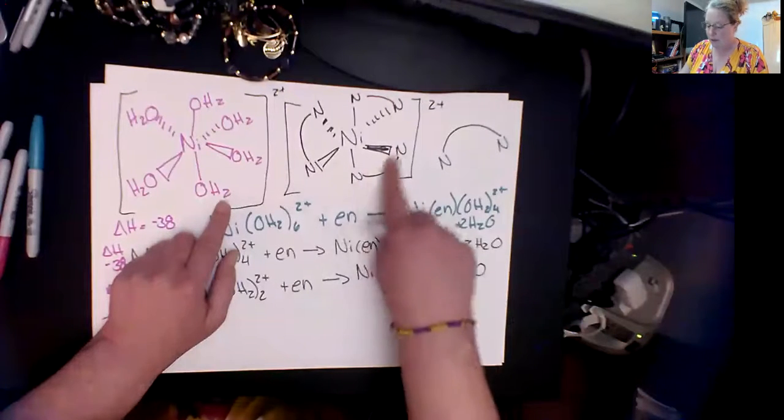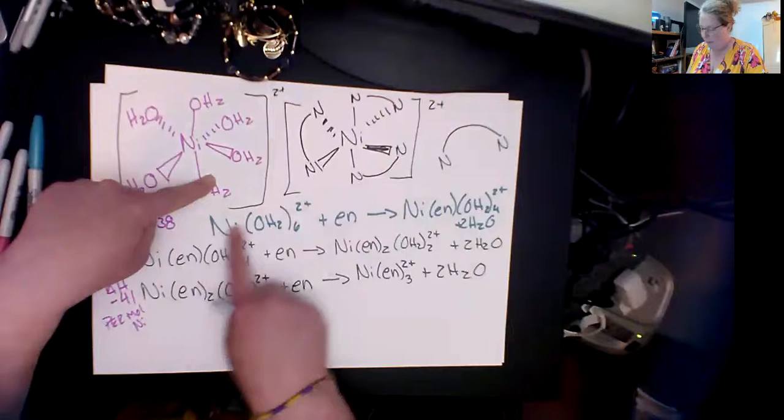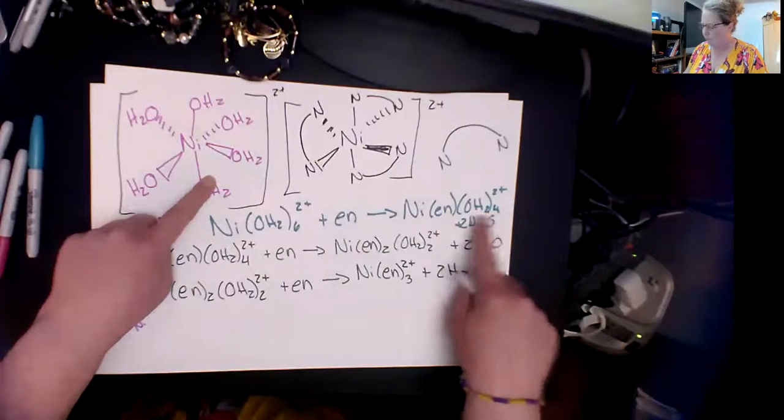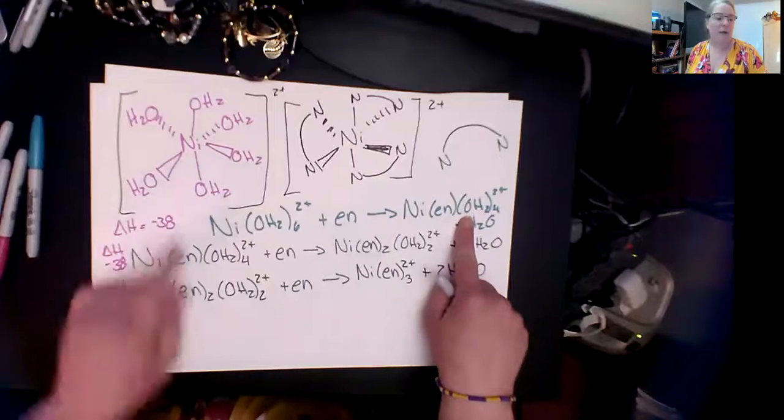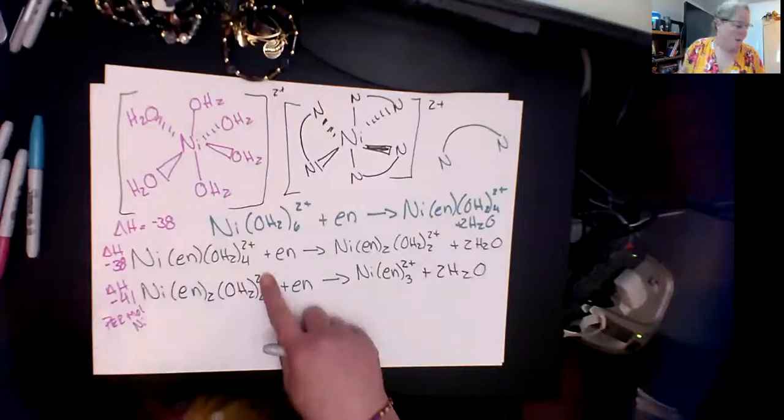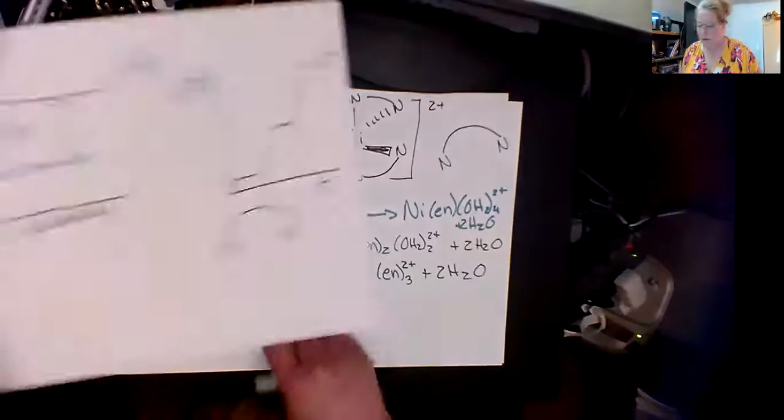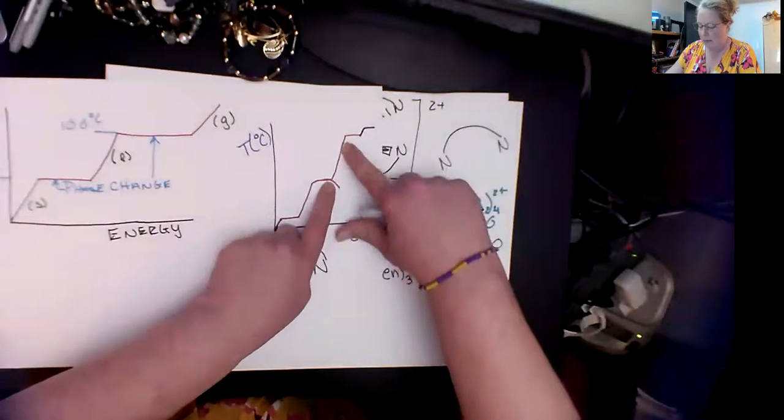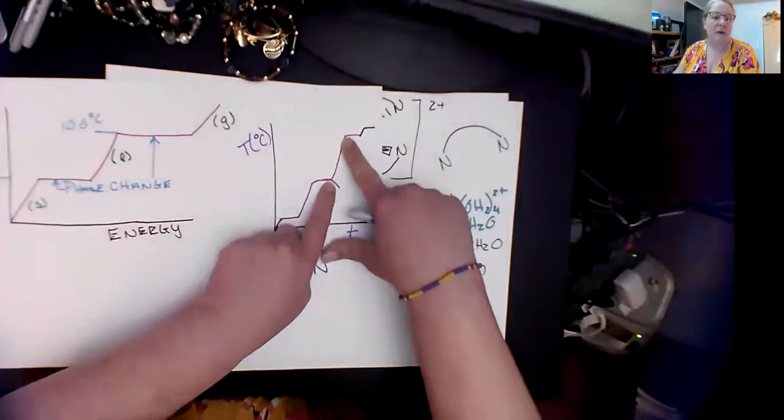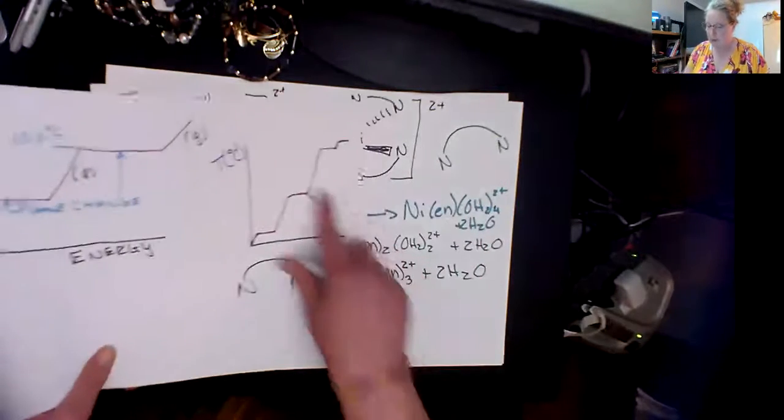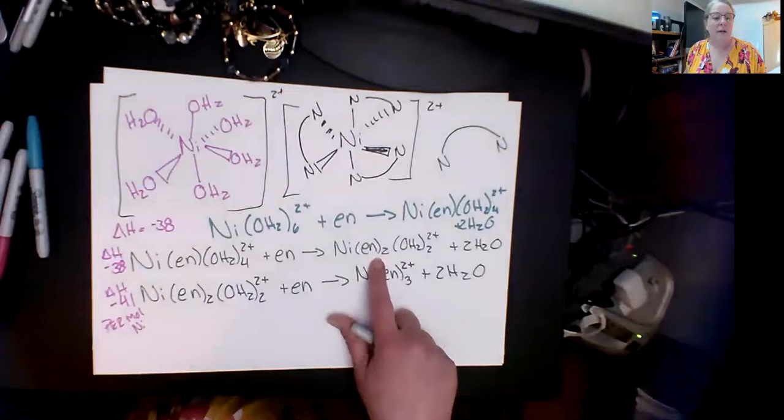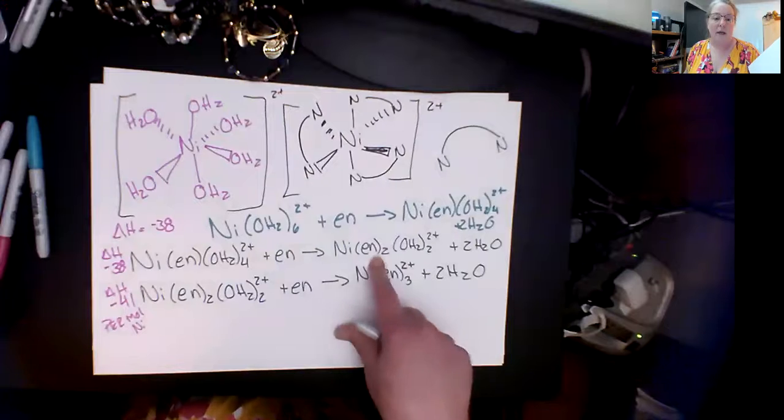For every addition I'm kicking off a couple of waters. If you want you can think of it as I've replaced these two waters on this first run through. On the second run through I'm going to start with what I ended with. Now I'm going to add my second edition of en and I'll see a temperature increase.